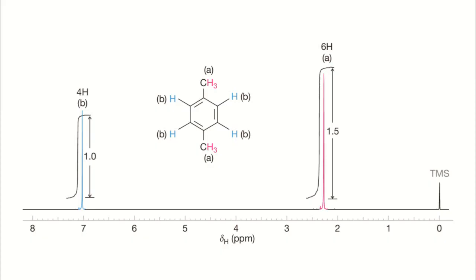In an HNMR spectrum, the signals for hydrogen atoms attached to a benzene ring typically appear between 6 and 8.5 ppm. In contrast, signals for hydrogen atoms on an sp3 carbon bonded to a benzene ring, benzylic hydrogens, generally range from 2 to 3 ppm.